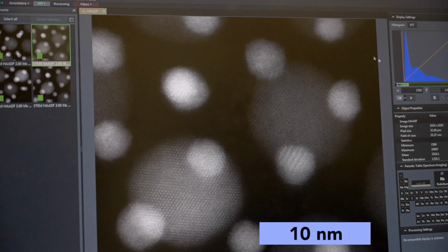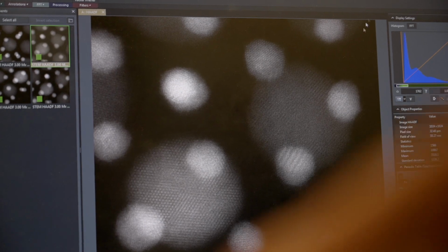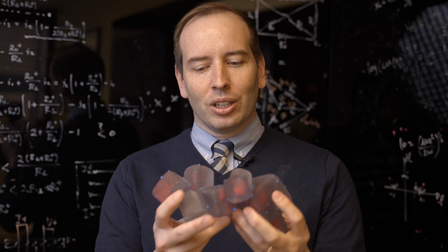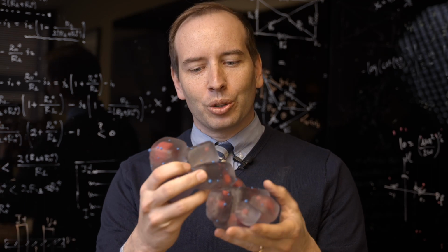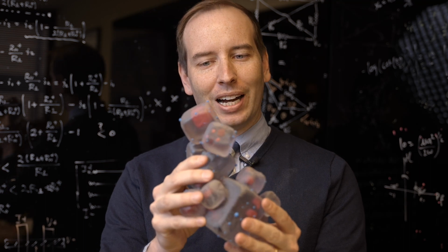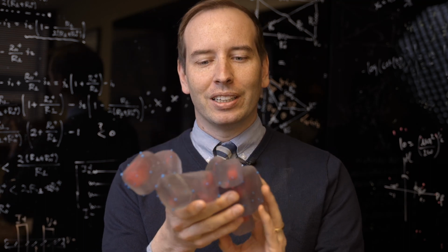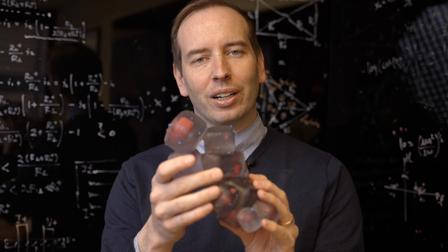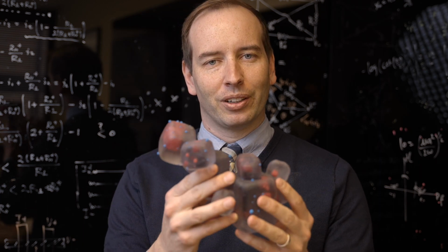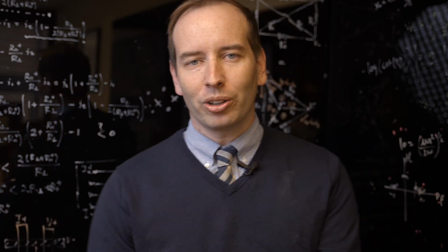And we can do this in 2 dimensions, we can even do it in 3 dimensions. So here is a material, the nanocubes used in clean energy applications that we've blown up 10 million times in size, and we've 3D printed it to understand how its nanoscale features impact the macroscale properties of this clean energy material. But we can go even smaller than this.